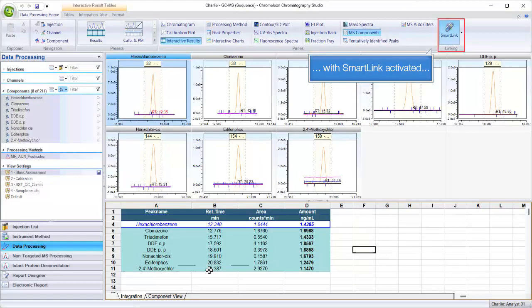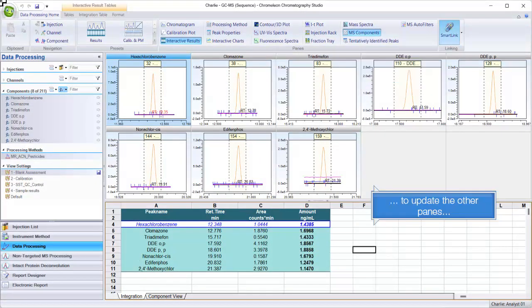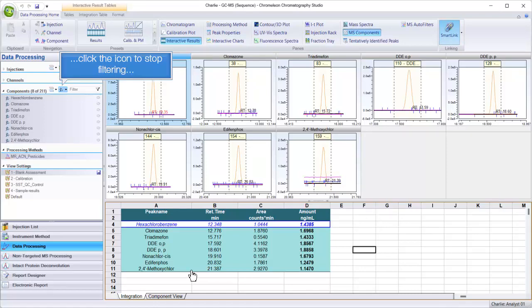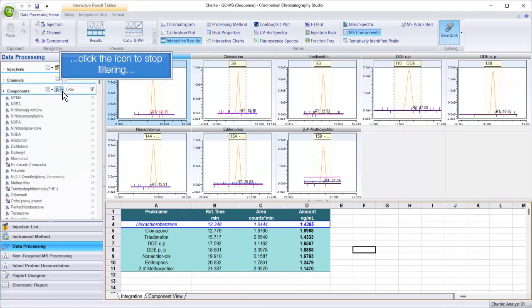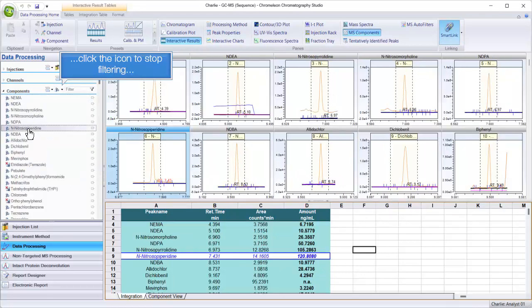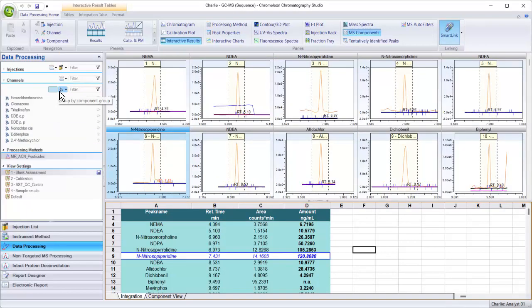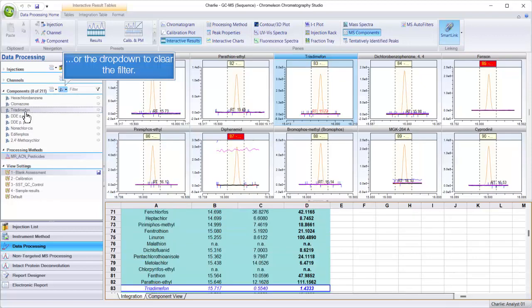With SmartLink activated, to update the other panes, click the icon to stop filtering, or the drop-down to clear the filter.